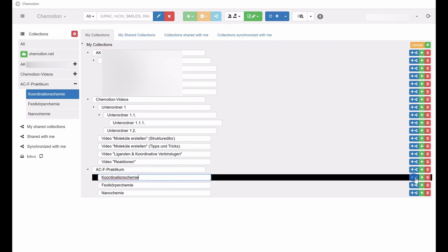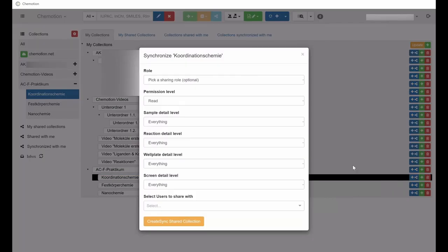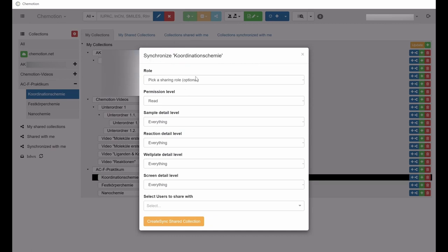As a result, a new window will open which gives access to the synchronization settings. This is similar to the configuration menu for sharing.